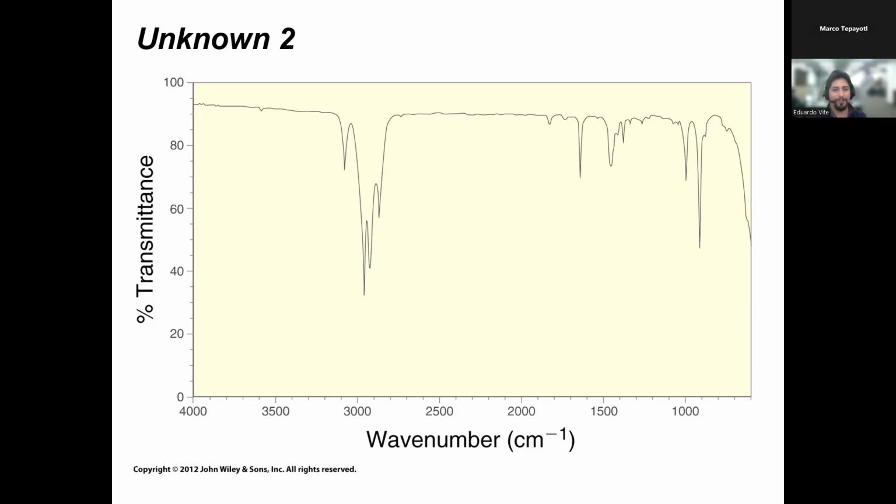Okay, CH stretches, of course. There's always CH stretches, right? At around 3,000. Primary amine? Question mark? I don't know. What do you guys think? Secondary amine? I don't know. What do you guys think? No. Okay, good. Why not? Why is it not an amine peak?